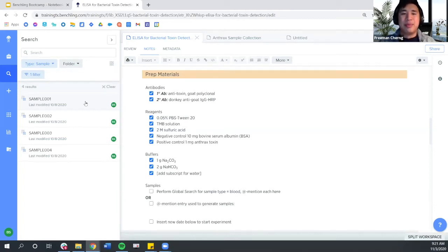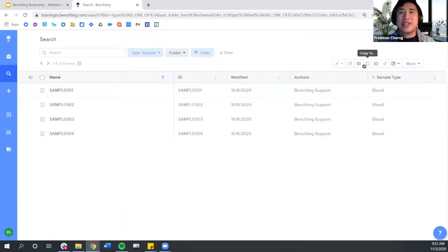Of course, this is a simplified scenario, but Global Search is a powerful tool that allows you to locate and organize your work. And we'll go over this tool more in depth at our advanced training following this one. If you click into the expanded view via this caret, you can leverage bulk actions such as archiving or moving for even more flexible data organization options.